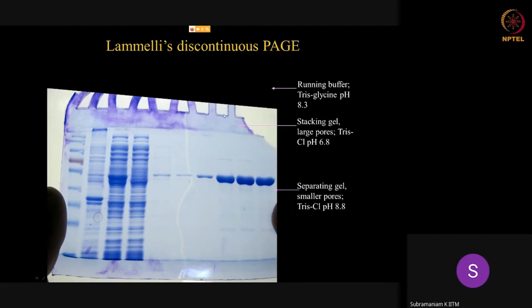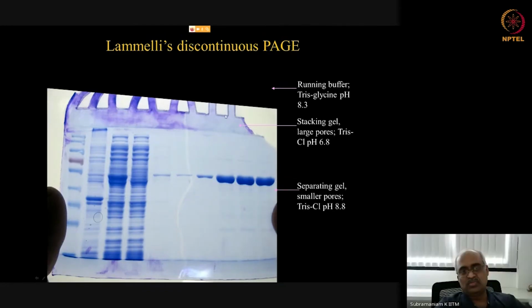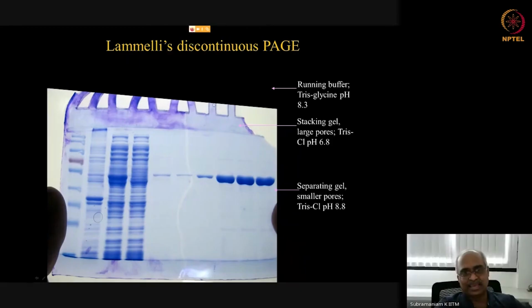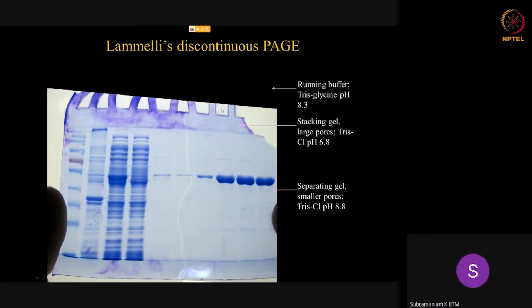Now when the protein solution migrates, it will be a 1 centimeter column that is migrating. So a given molecular weight protein is present all through this 1 centimeter column. So every band will be exactly the same height as the original column of liquid that was there. So due to that, you are not going to get fine sharp bands like this. Okay, so look at that. This well was filled, but this protein is only a sharp band. So if it is going to be wider like the original size, then the next one will overlap and separation will not be good. Okay.